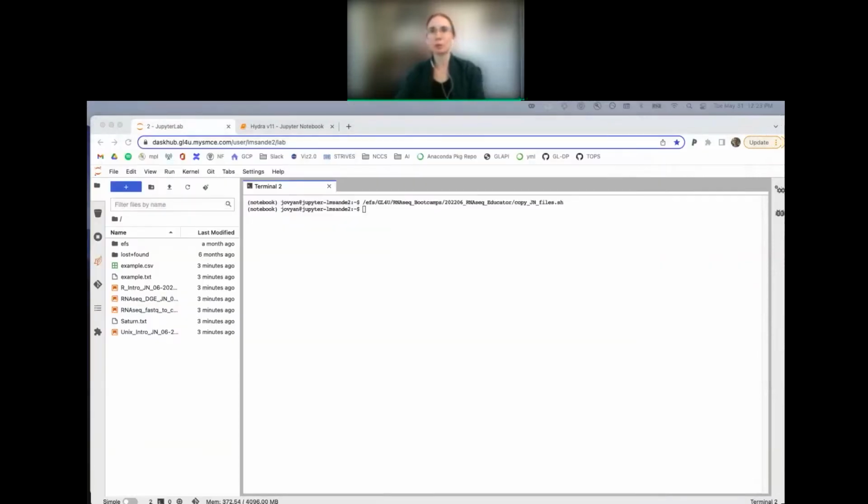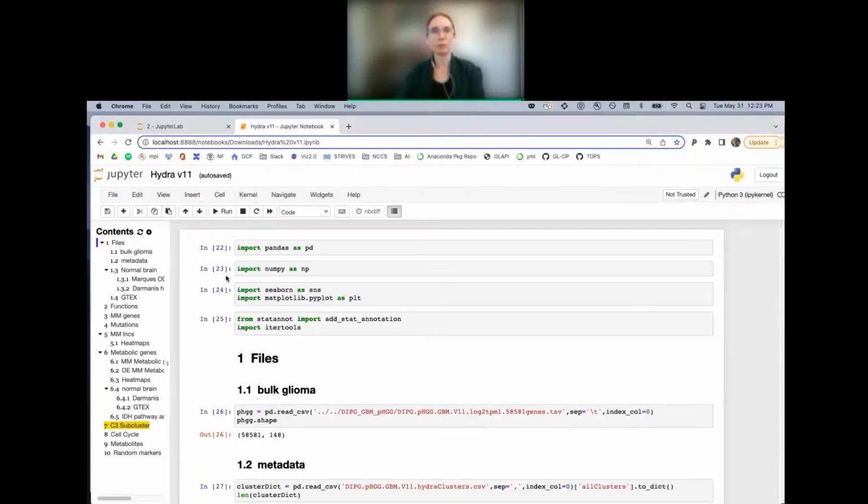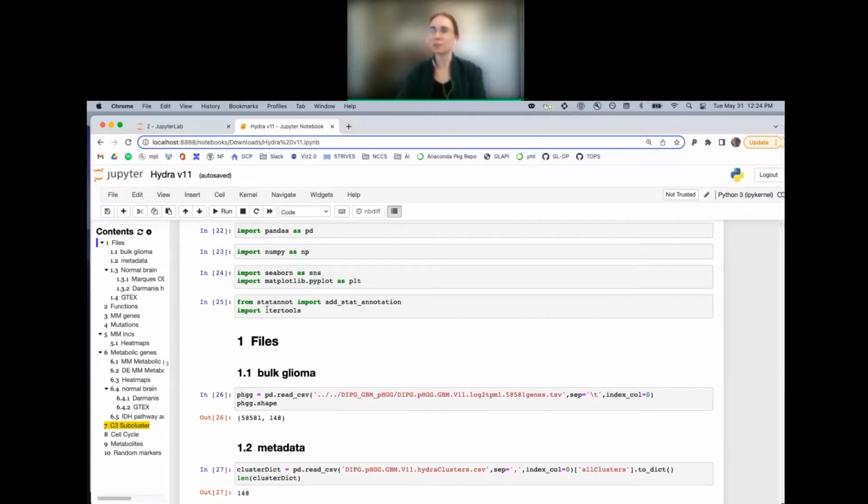The Jupyter Notebook infrastructure was developed specifically to be able to have reproducibility and shareability of code in a very readable way, a very intuitive way. So I'm showing here a completely random Jupyter Notebook. This has nothing to do with the bootcamp today, but I just wanted to show an example of how you can have little cells here where you can just write notes. You can explain to the people coming after you what you've done.